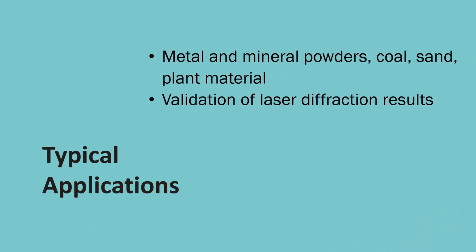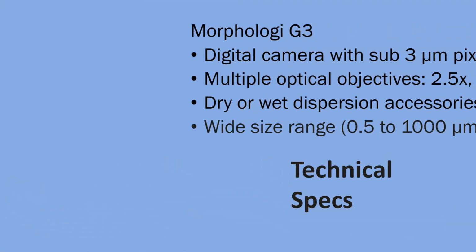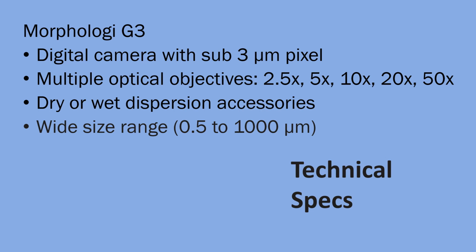Typical applications include metal and mineral powders, coals, sand, plant material. Also, this technique is used to validate laser diffraction results. These are technical specifications for our Morphologi G3 unit we have at MCL. You can look into more details on our website.